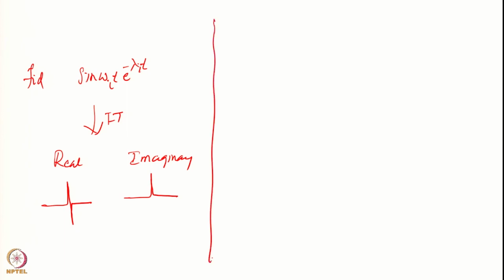Now often we find that the signal is not exactly dispersive or absorptive, sometimes we get signals which are like this.